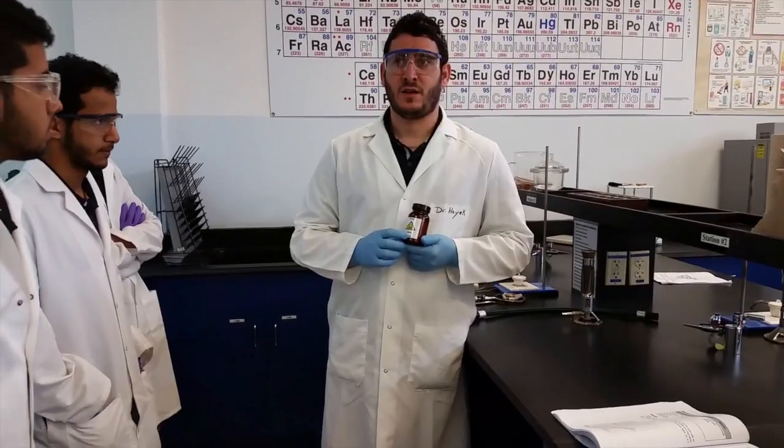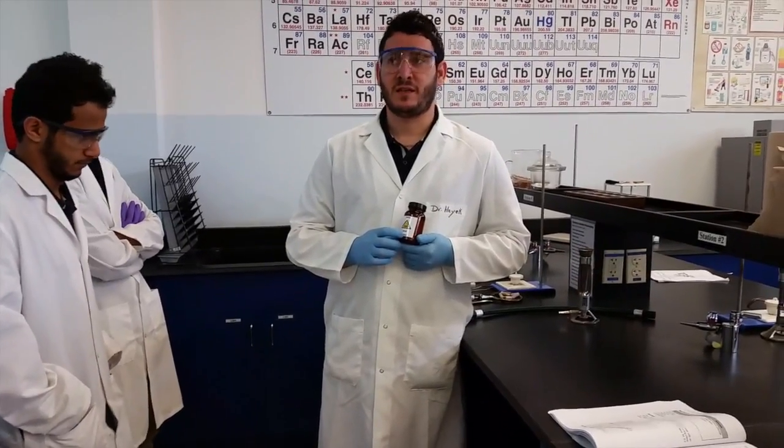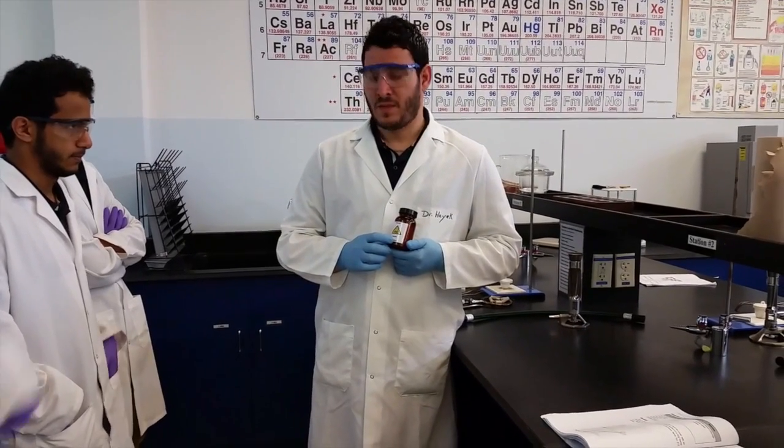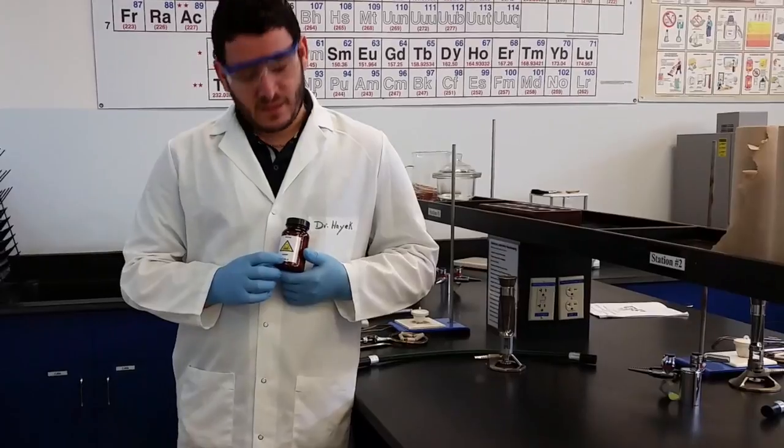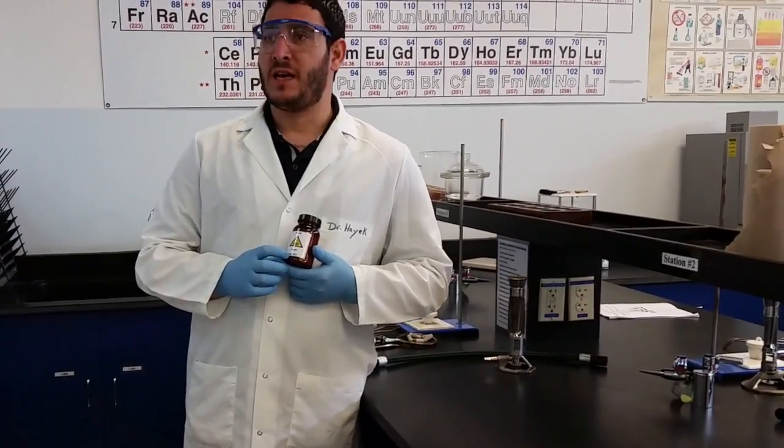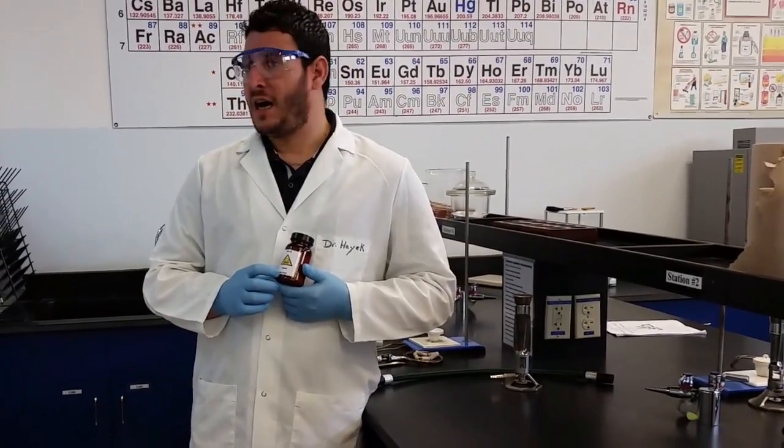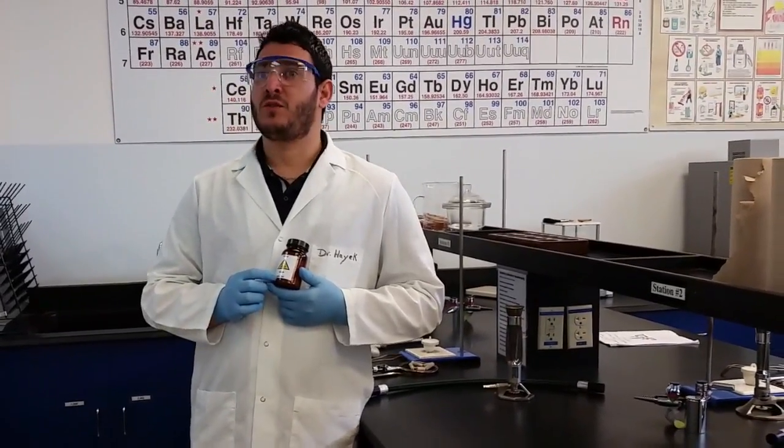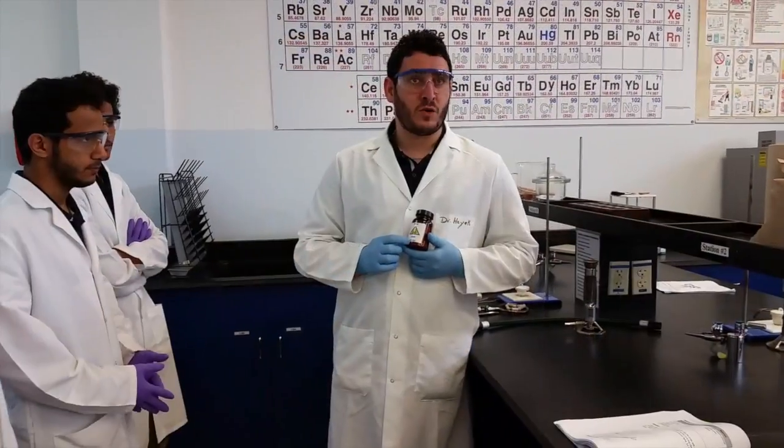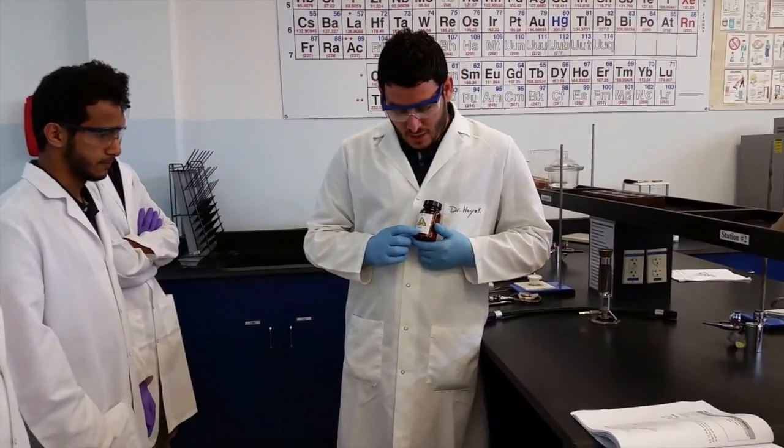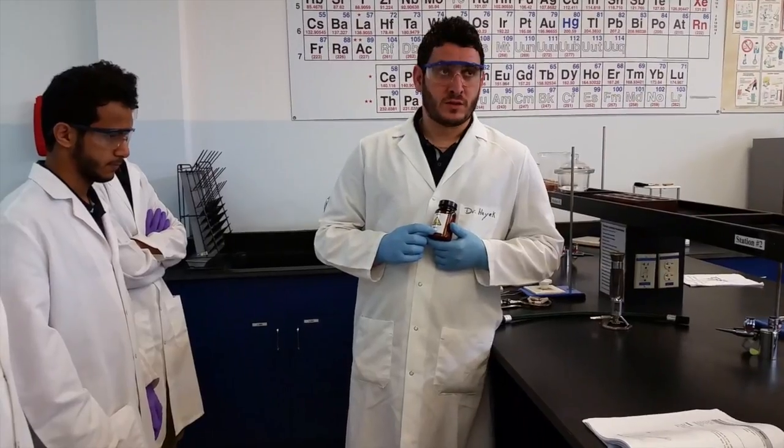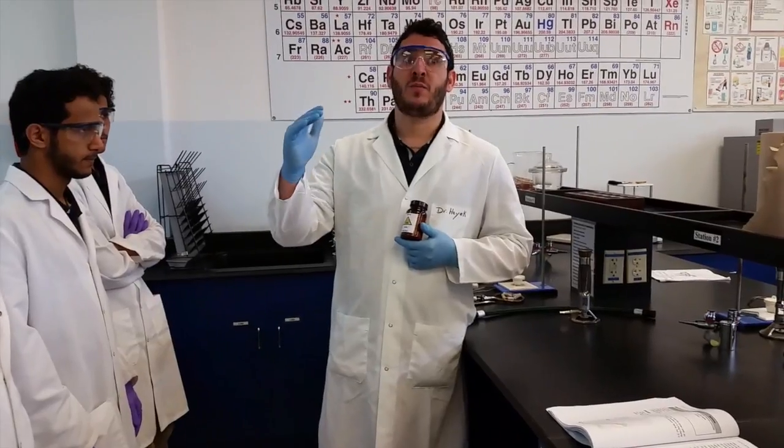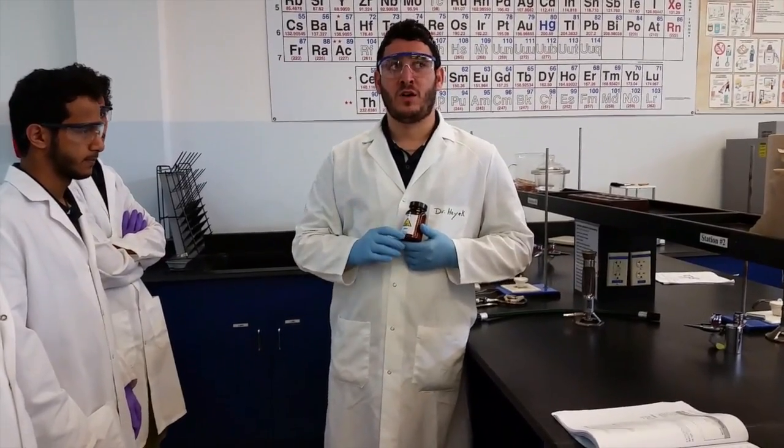To determine X, X is the number of moles of the anhydrous - the salt alone without water, which in this case is barium chloride. You need to know the number of moles of barium chloride and the number of moles of water, because X equals number of moles of water divided by number of moles of barium chloride.